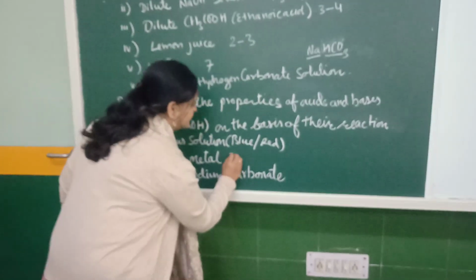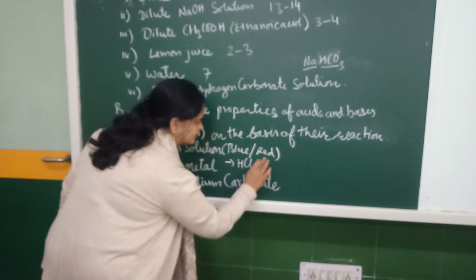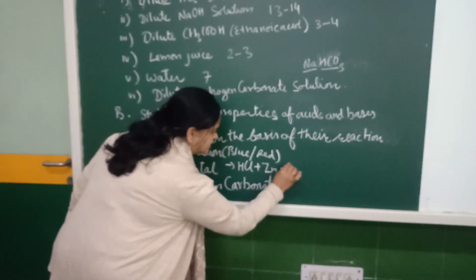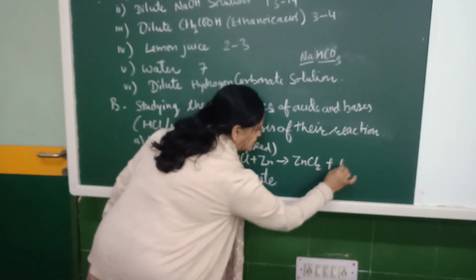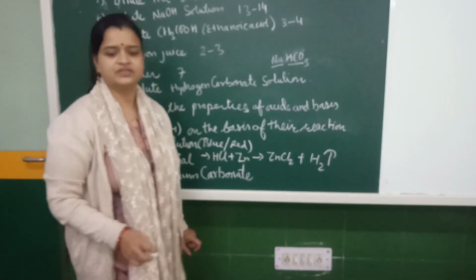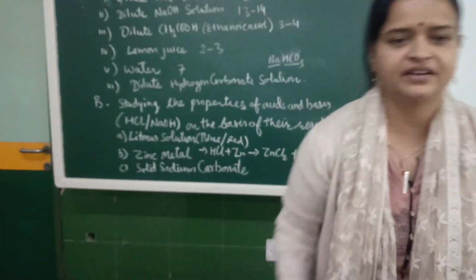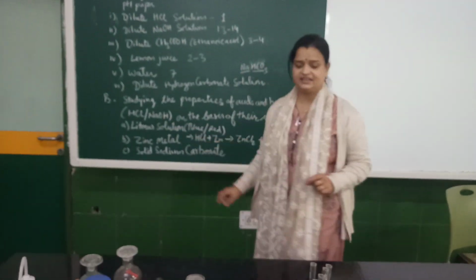I am writing the equation here. HCl reacts with zinc, it gives ZnCl2 plus hydrogen gas. This hydrogen gas gives a pop sound when we bring a burning candle near it. The next is, let us take the reaction of NaOH with zinc metal.